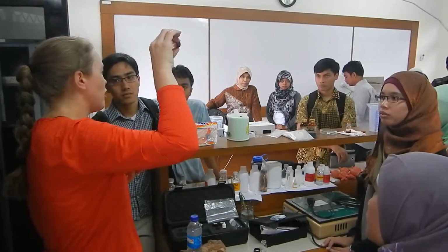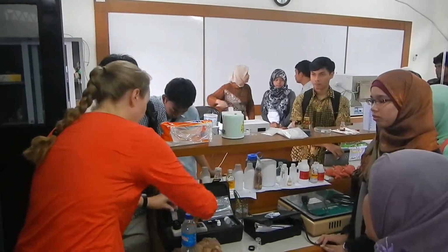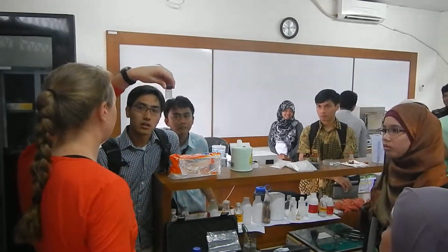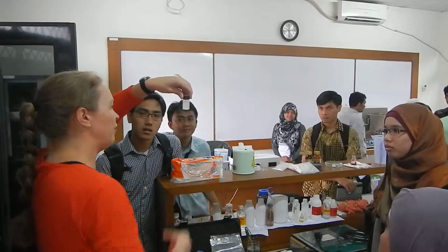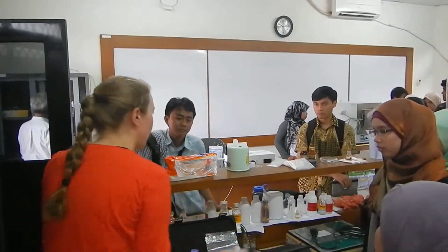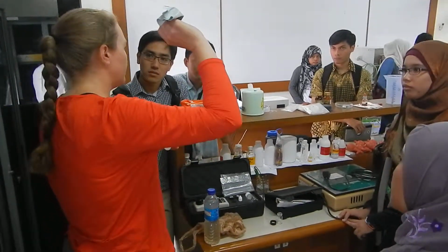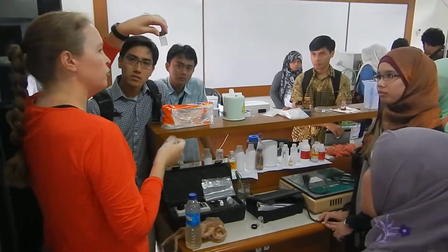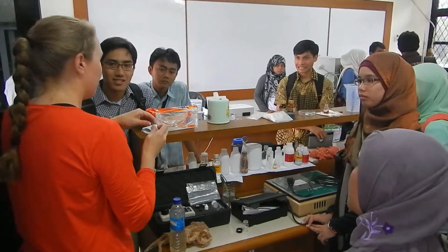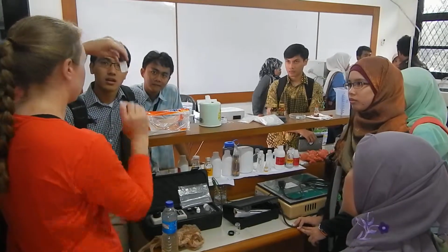For what we're doing today, we're not doing a research project, we're just trying to teach you. It's perfectly fine. When you do these important things, okay, so light's got to pass through this, right? What do I not want to do if I'm picking this up? I don't want to grab it down here and put my fingerprints all over it, because if I put my fingerprints over it, I'm going to change what it is. The other is, be careful with what you wipe these off. These cloths are made to go on like your eyeglasses and things like that. They're not going to scratch. You do not want to scratch these. So don't just grab a paper towel and start wiping away on it, because then you're going to have problems. And usually when you wipe it, they tend to go in one direction.